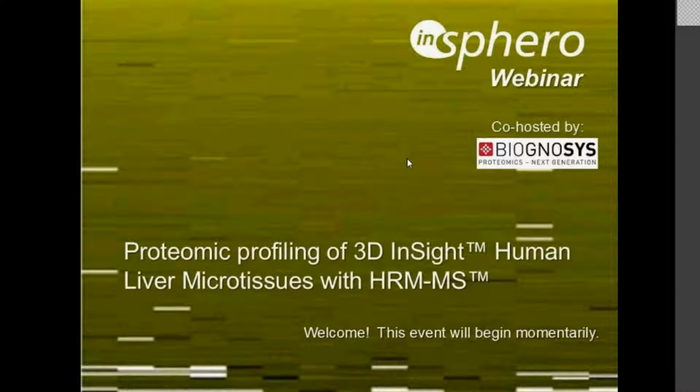Today's webinar is being co-hosted by Biognosys AG, a valued partner of InSphero, who also happens to be a neighbor of ours in Rinner. And today we'll be covering some recent studies characterizing InSphero 3D liver microtissues using an advanced mass spec technology from Biognosys called hyperreaction monitoring mass spec.